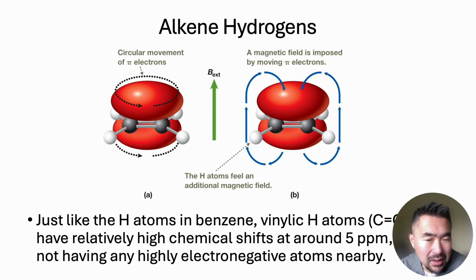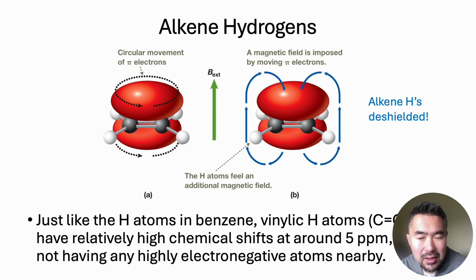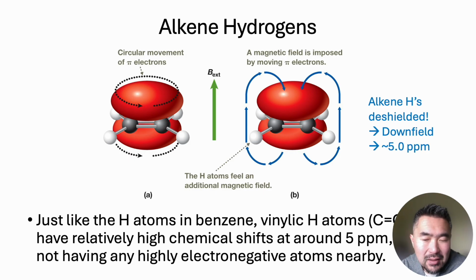And in alkenes, the pi current is not as extensive as benzene, in a ring, a circle, forever kind of current. So for that reason, these protons are de-shielded for the same reasons as benzene, but not as much. So it's usually around 5, and this could vary from 4.5 to almost 6, depending on what else is attached to the alkene.